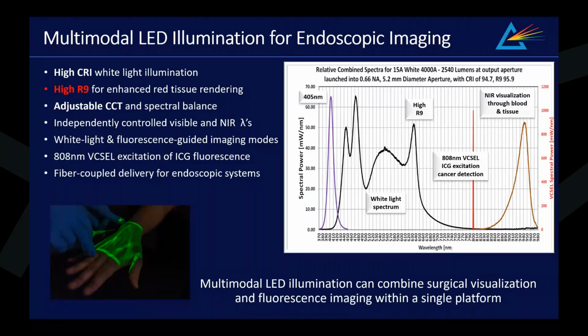Fiber-coupled delivery remains particularly important in endoscopic systems where compact integration and high optical throughput are required.